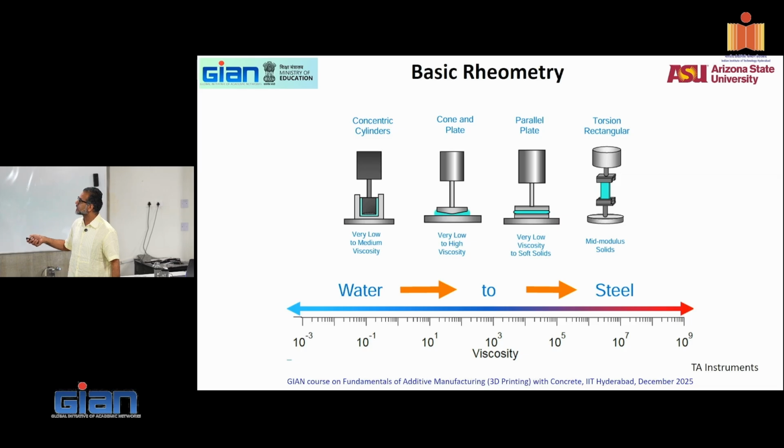So this is one cylinder and your turning cylinder is another one. And this blue stuff, I see it as blue, some of you may see it as green, whatever that color is, is the liquid in between. You shear this cylinder and you measure the torque required to move the liquid. So that's for concentric cylinders. You can do it for water, for oils, etc.